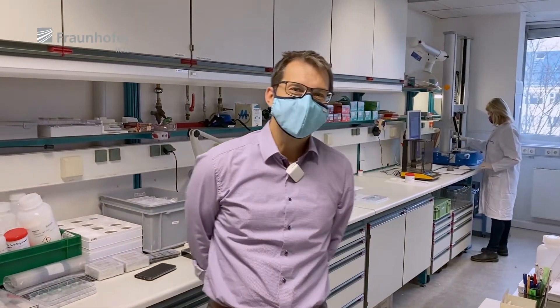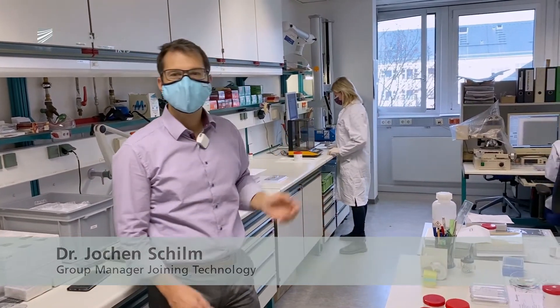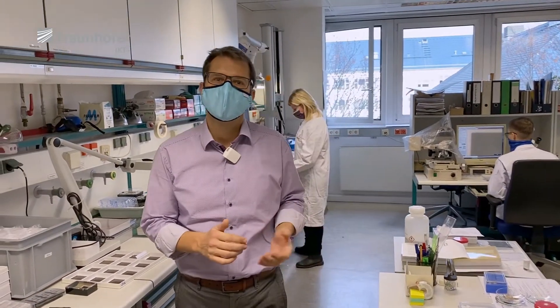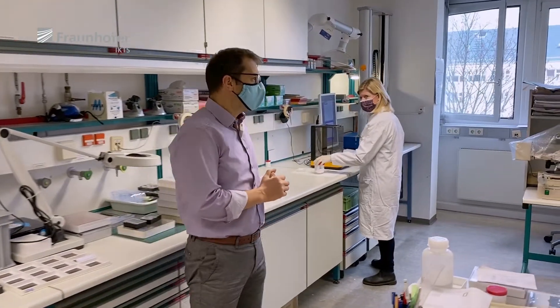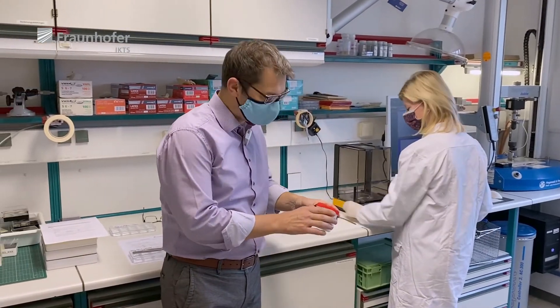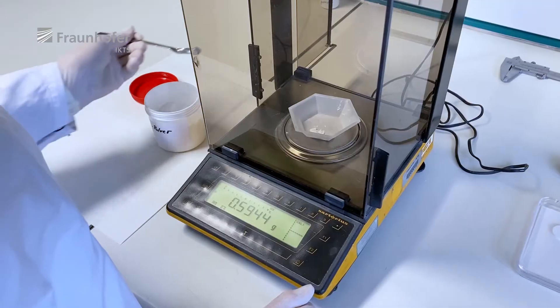Welcome to the glass characterization laboratory. In this laboratory, the glass powders arrive and we begin our characterization procedures. What we can do here includes powder pressing into compacts for furnace processes, light microscopy, optical dilatometric measurements, conductivity measurements, and measurement of mechanical performance. The glass powder arrives here usually after the milling process, and then we start to make some powder compacts.